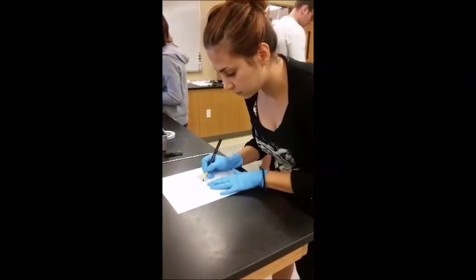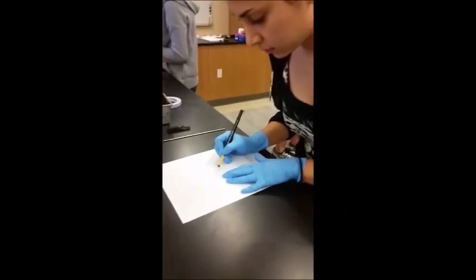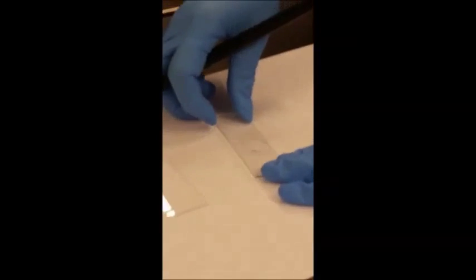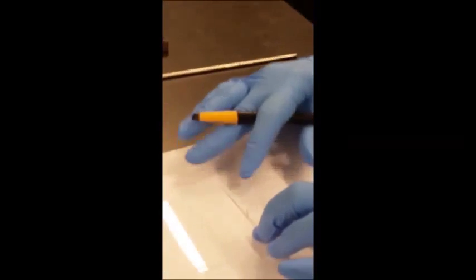We set up our slides on a piece of paper first, and then we try to make a circle on the slide just as big as we want. And then we have to make sure that we turn the slide over because we want to put the smear on the other side, not at the same time we put the circle on. And then we put a little bit of water on the other slide.